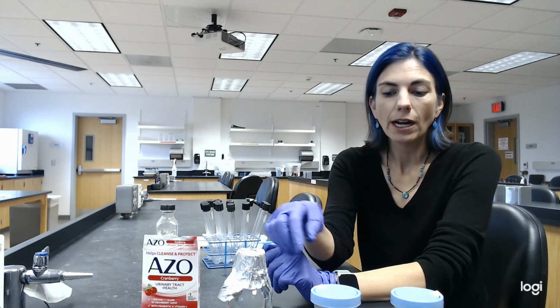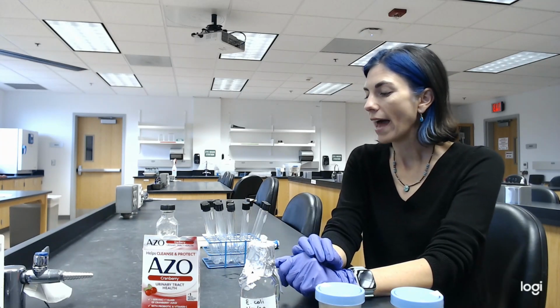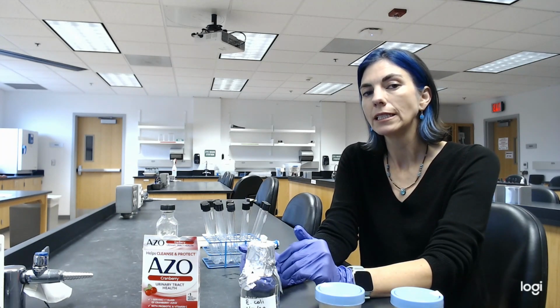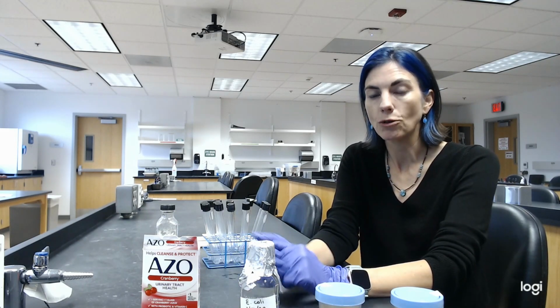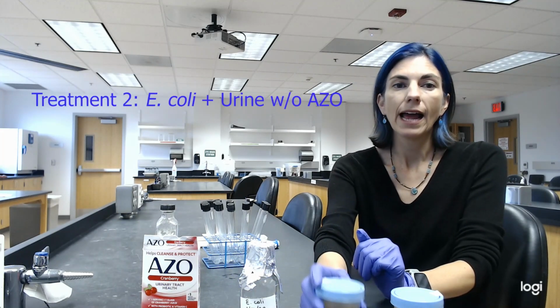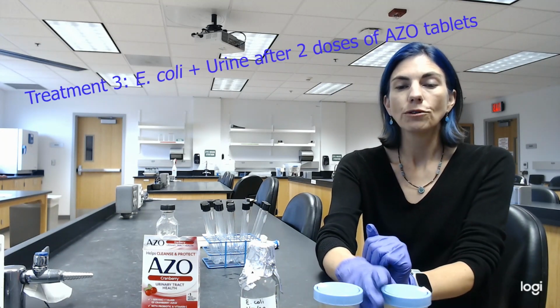What we're going to do is combine the urine samples with E. coli broth. I also am going to combine some of that E. coli with just regular nutrient broth, which E. coli grows really well in. I'm going to look to see if there is a difference in how E. coli grows in each treatment. One treatment will be E. coli plus nutrient broth. Another treatment will be E. coli and urine prior to taking Azo tabs, and a third treatment will be E. coli and urine after taking 2 doses of Azo.